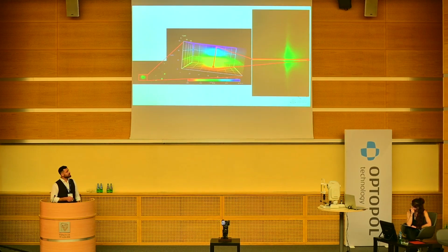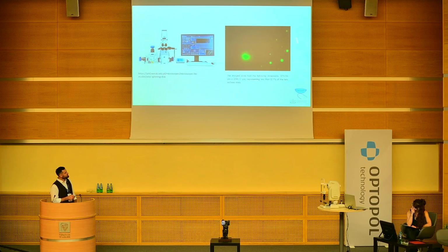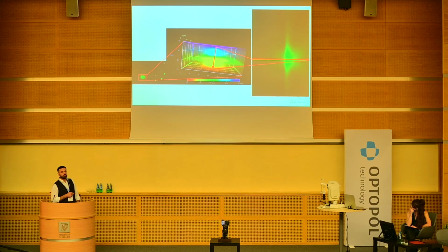But what we've done, this is the image after 10 minutes of the measuring. So the green lights represent the lipid agglomeration on the lens surfaces, and then we picked the biggest one, and we've done the precise scan in the X, Y, and Z direction. So we create a 3D image, which allows us to then look at the cross section of the lipid agglomerates and the penetration of the fluorescently tagged lipid into the lens matrix.